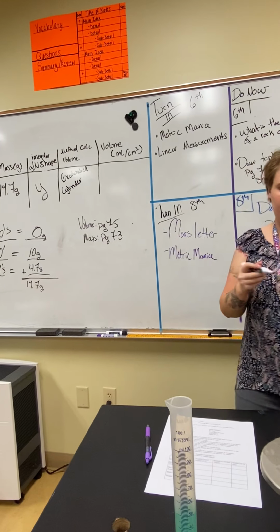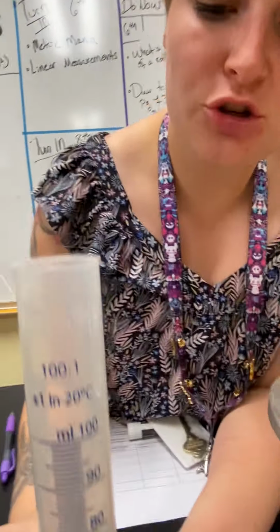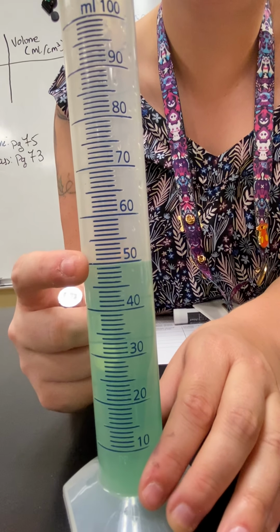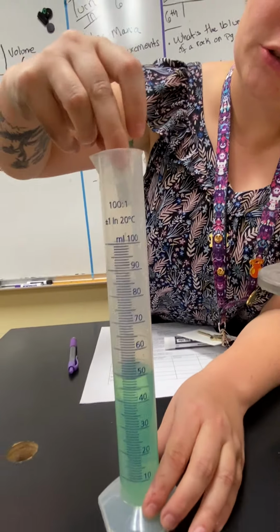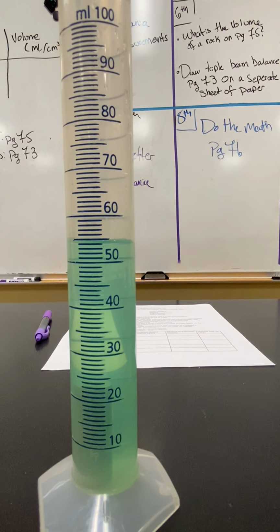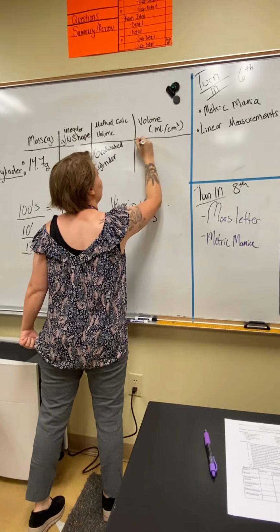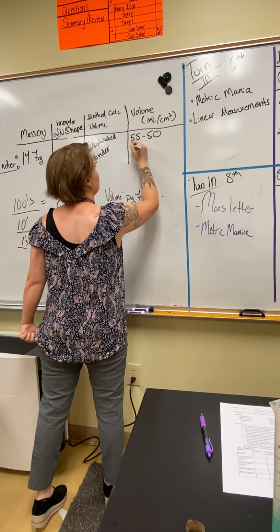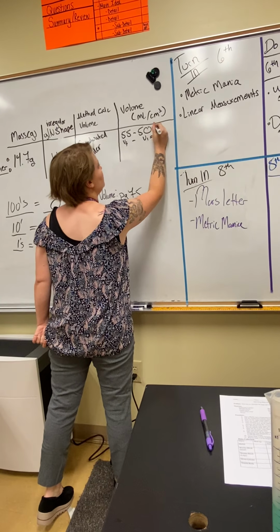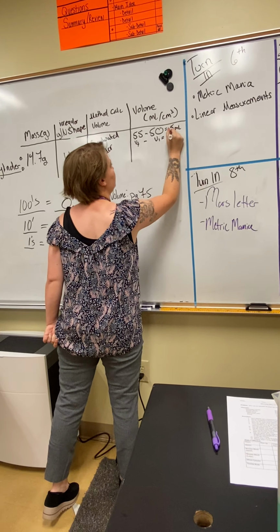All right, so here's where we calculate our volume. Got your object right here. You look at the initial water line. For this lab, we are always going to start out at 50. I have taken great care to make sure that you know that we start out at 50. So our initial value is 50. We're going to plop that in. All right. Our next value is going to be 55. So our final volume was 55, minus 50, our initial volume. You take final minus initial, and then you subtract it. And I got 5 milliliters, right? 5 equals the volume of the object.